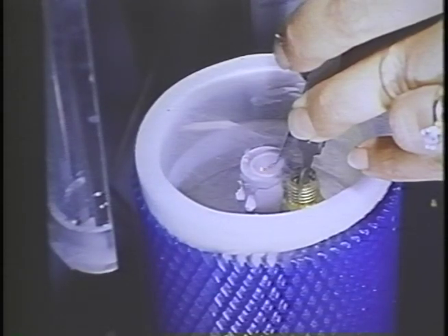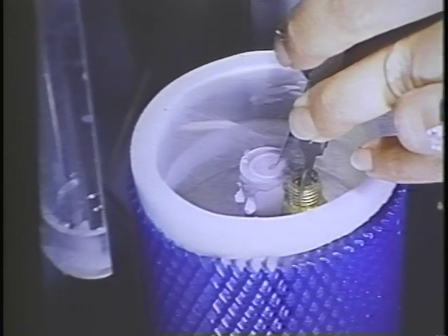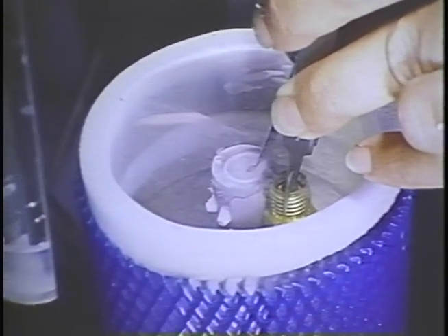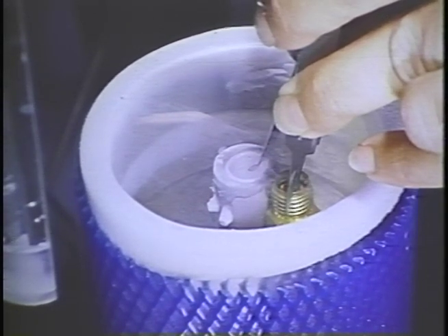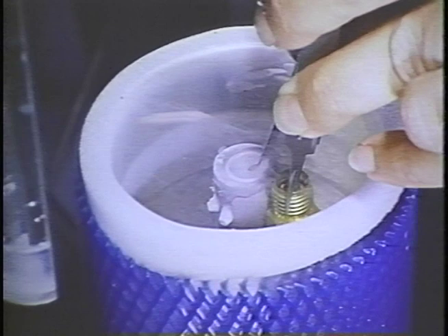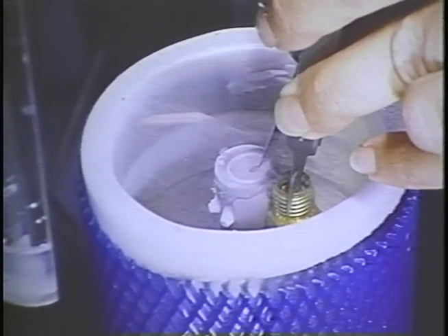Next slide. The frozen grid is then quickly placed in a transfer vessel containing liquid nitrogen, where it remains at this temperature until either viewing directly in the cryo stage or after further processing using freeze substitution.